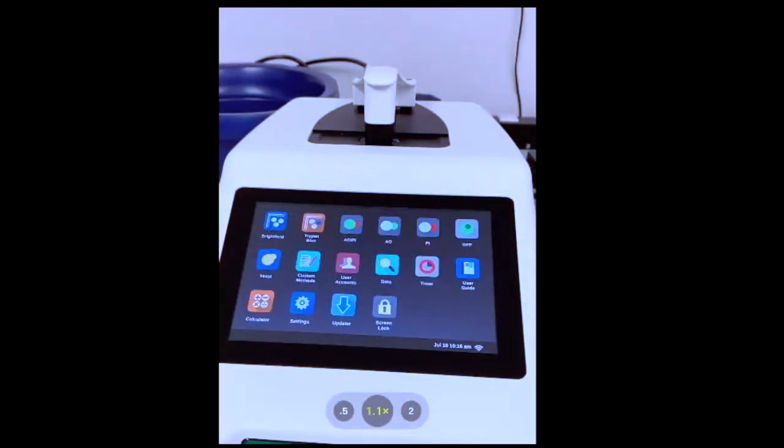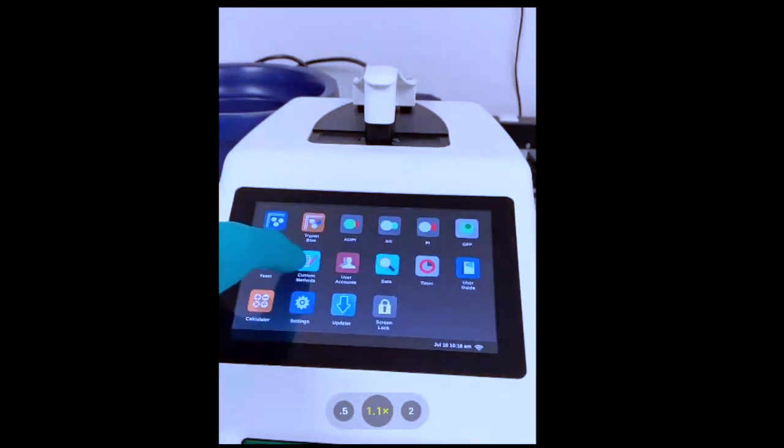I see another question here. Dealing with baculovirus, can the occlusion bodies be assessed by this method? I don't think that the occlusion bodies are going to be visible on an automated cell counter. You probably would need a slightly higher end microscope for that. That said, we do have our custom methods app here that gives our users a lot more freedom over how to set up parameters.